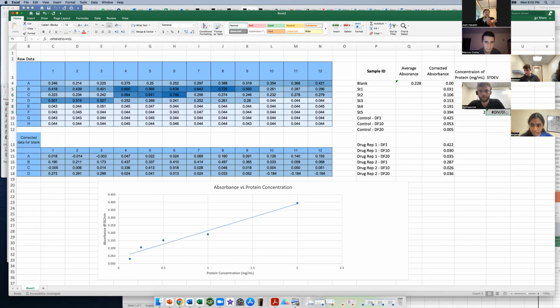I think you're supposed to do it for all your data points for your table here, but I'm not going to do that. So same way we did average, we're just double clicking and fixing the box locations so that they go to where they're supposed to go. Standard 4 and standard 5.